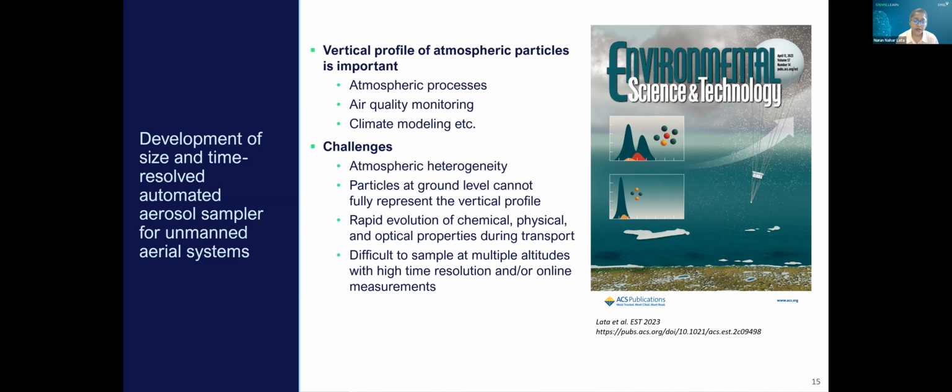With the existing aerosol samplers, it is difficult to sample at multiple altitudes with high time resolution and also with online measurements. All these challenges motivated us to develop this new size- and time-resolved automated aerosol sampler for the unmanned aerial system.